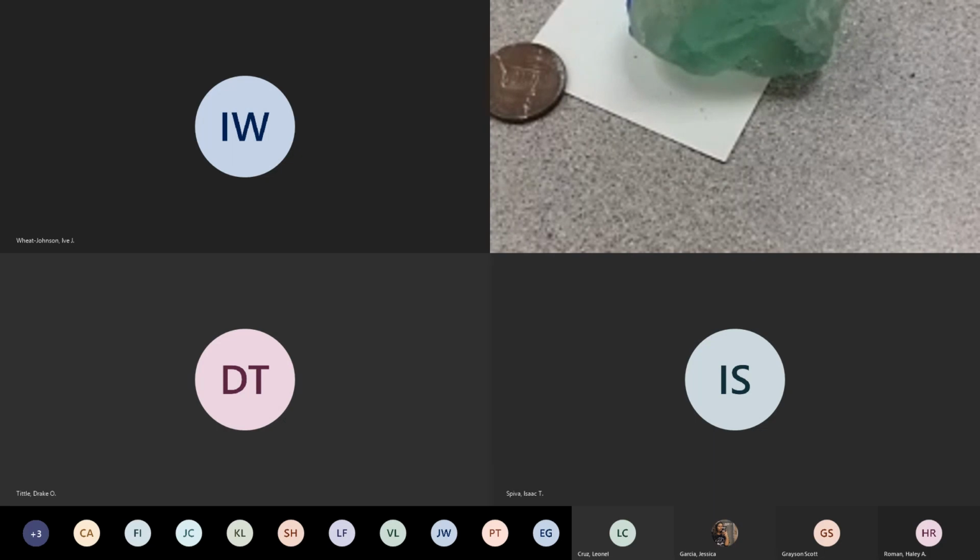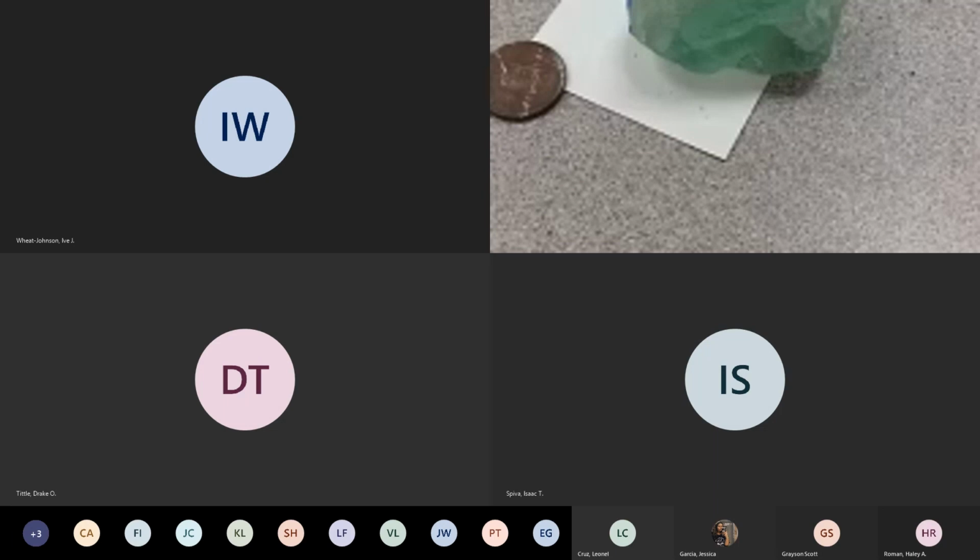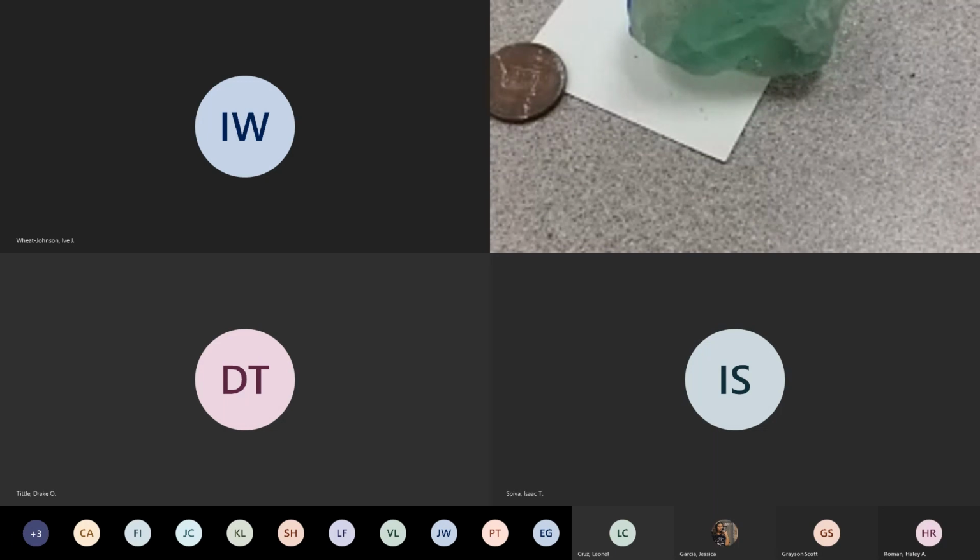Yeah, between 3 and 5. So now that we've introduced ourselves to these properties, we're going to skip the introduction part next Thursday, and we're going to have 16 samples, and we're going to run through the tests on that. So I'm going to generate the data for that, just like you would if you were sitting here in the class. We're going to generate the important data on those 16 samples, and then you're going to use the flow chart in your lab book to identify them.